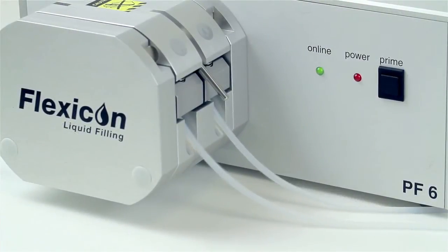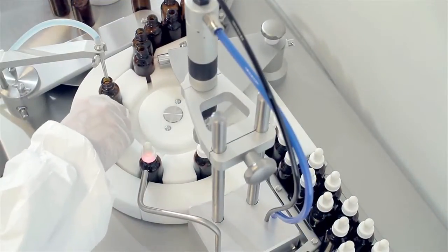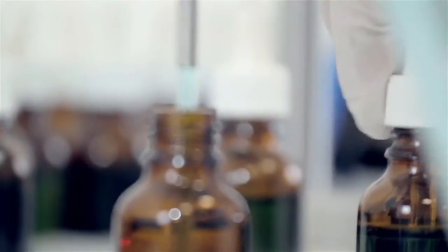The machine's small footprint makes it easy to use in different locations within a production facility, including use within a laminar airflow unit.